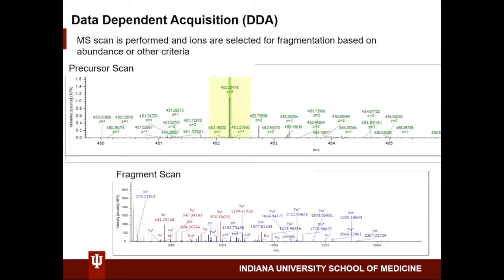An example is here where you have a smaller range of precursors, but it is selecting this window, and specifically this 452 is the main ion in this window. You can imagine, however, that the window of selection is user-defined, and you might include other ions in it. You take note in the data analysis that there is interference or potential other things present in the fragmentation process.